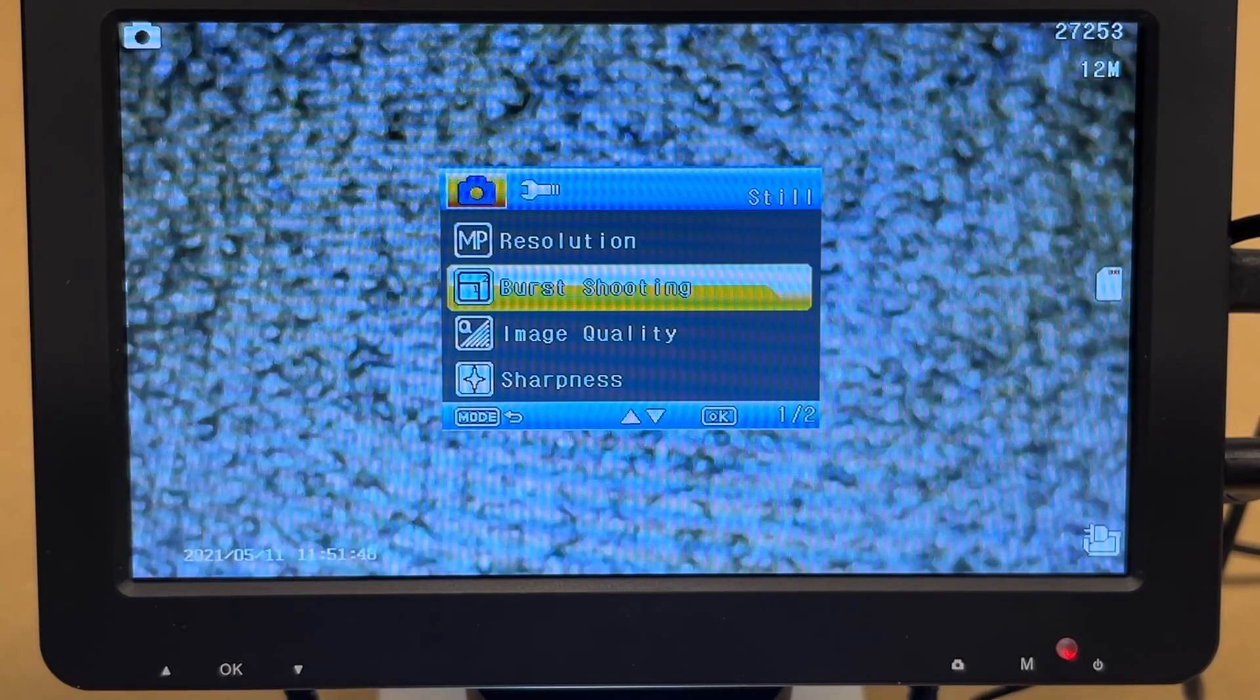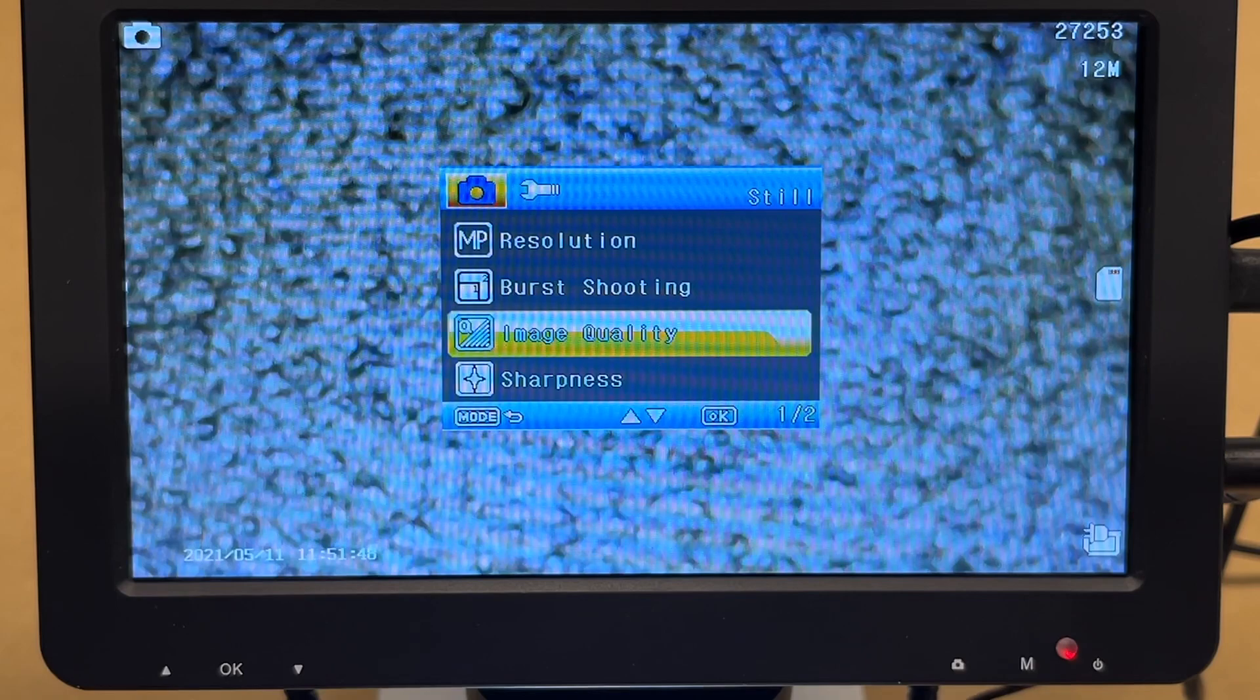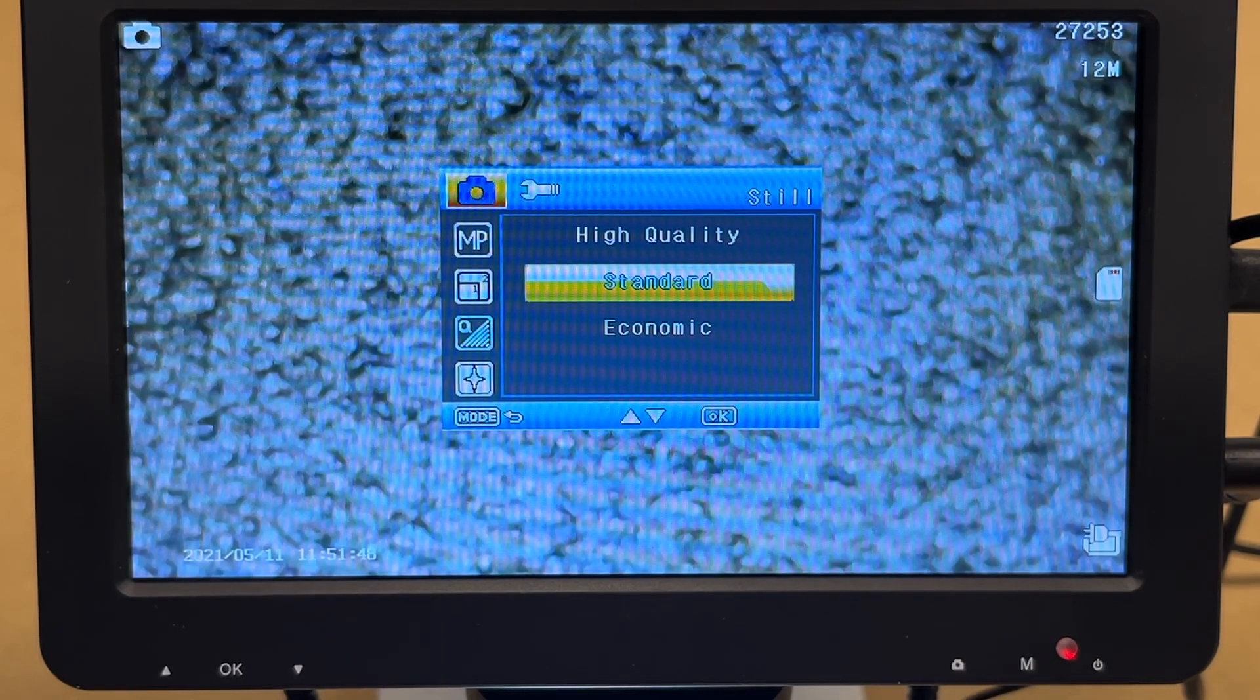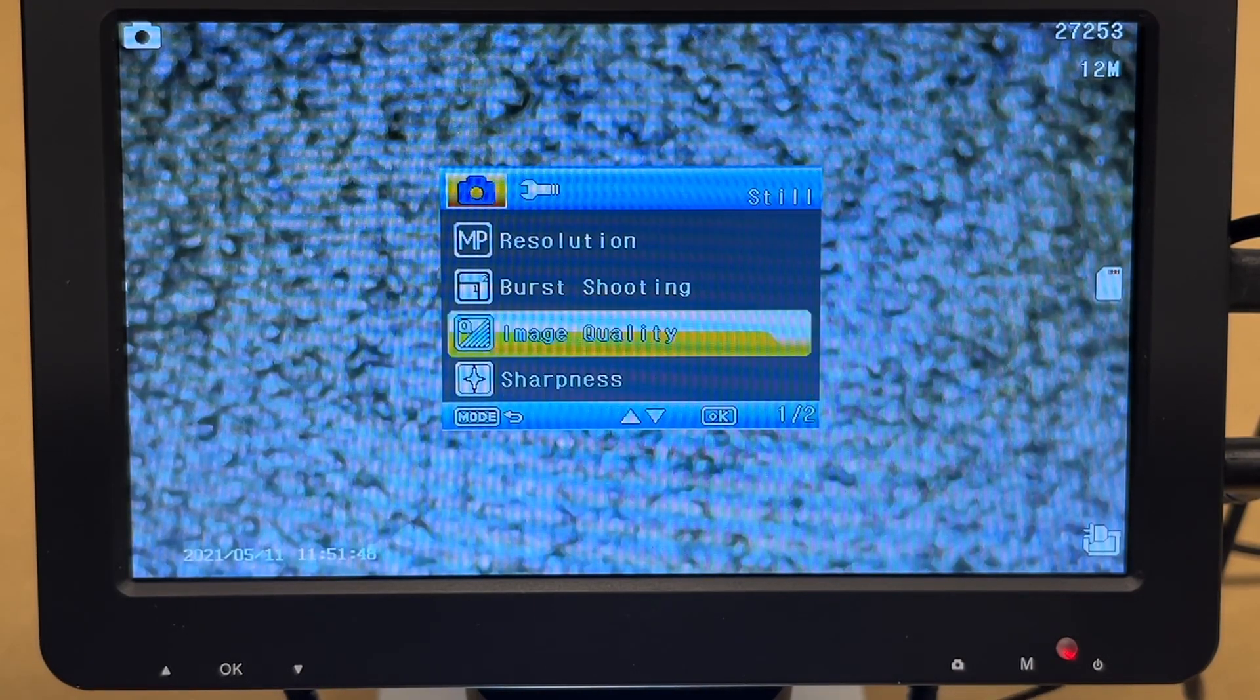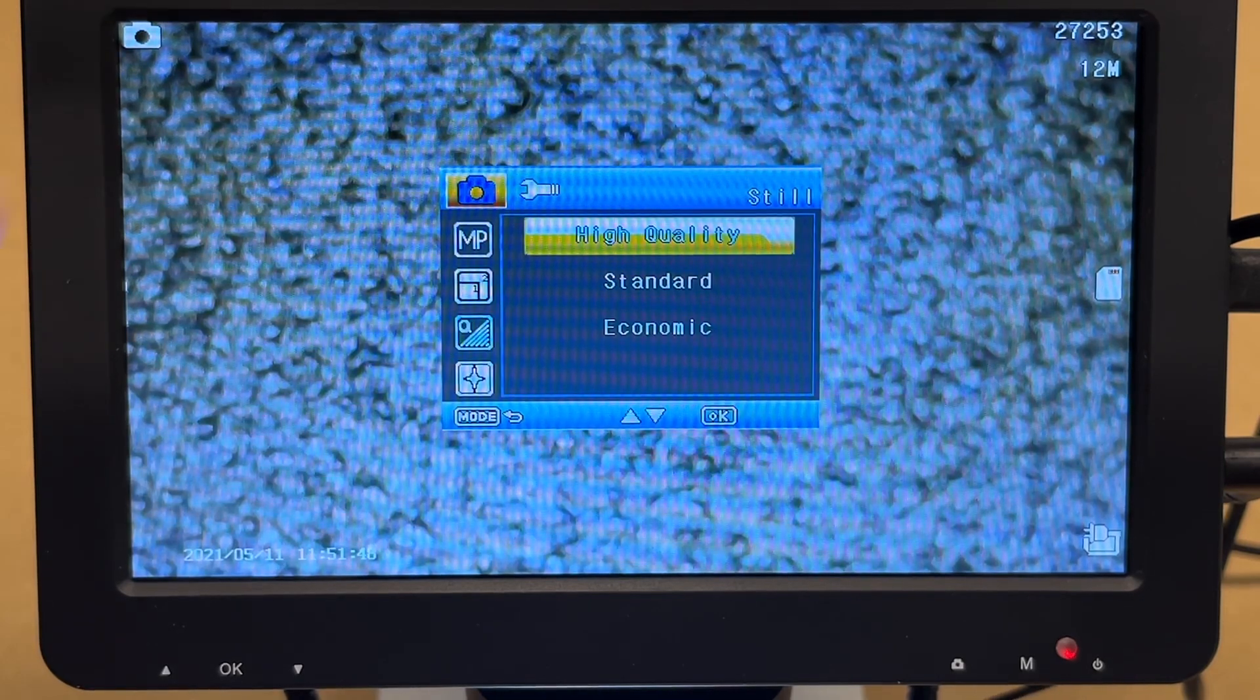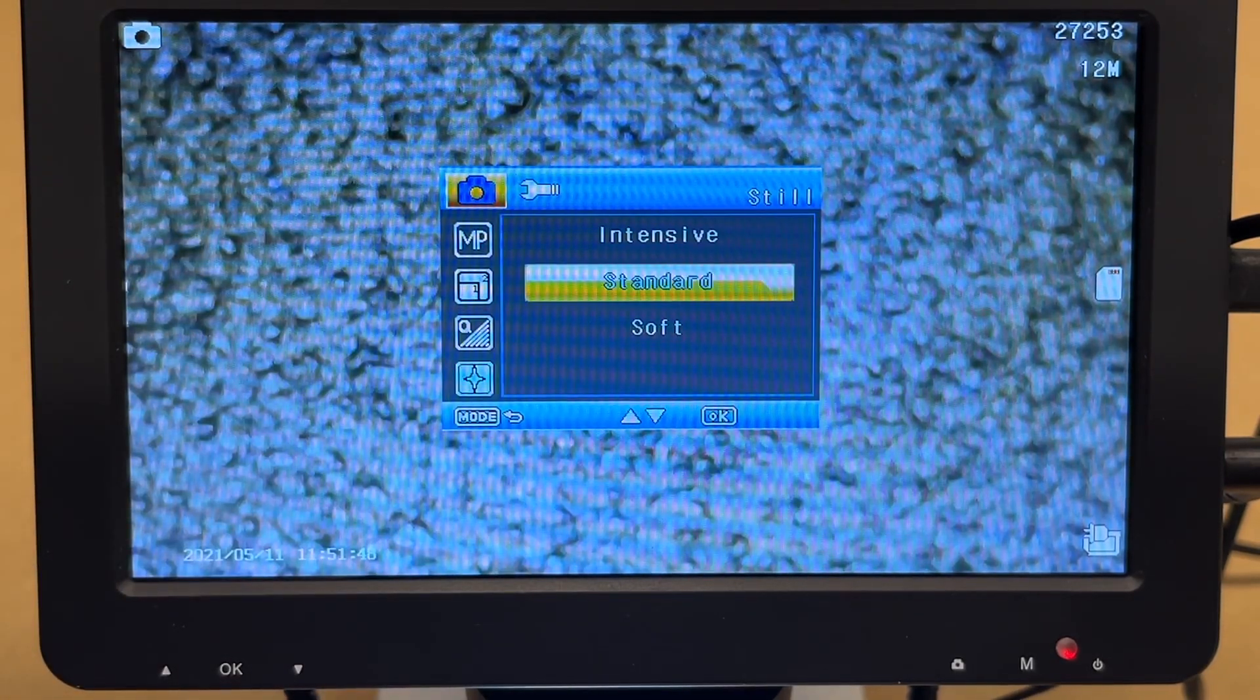If I want to go back, I can hit the M button again. Now I'll go down. It has burst shooting on or off. So I'll leave that off. Next we have image quality. We have high quality, standard, or economic. I'll switch that to high quality. I'm not sure if that'll make a big difference, but I just pushed up and then hit OK to save that.